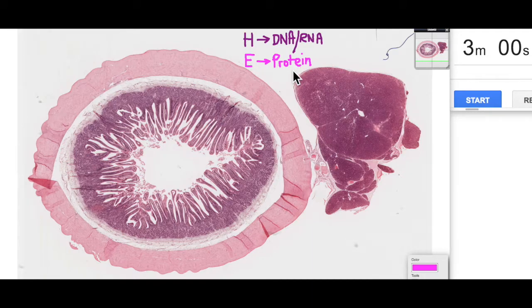We've seen it at this overview tissue level to give you an impression of early interpretation of slides. Today we're going to focus on interpreting this H&E staining at the cellular level. We're going to really zoom in and look at some of these cells and how they're stained with H&E. Let's start our three minutes.